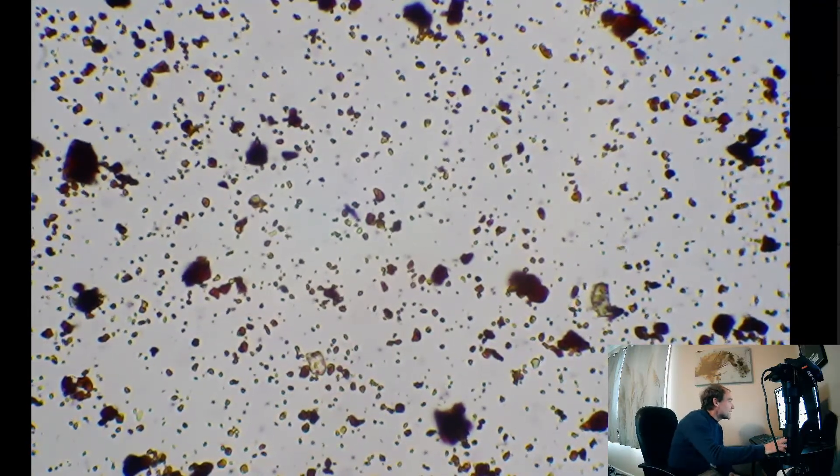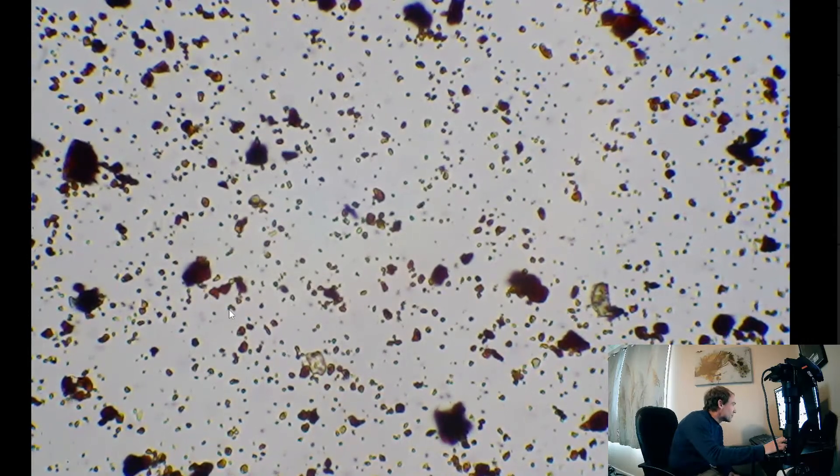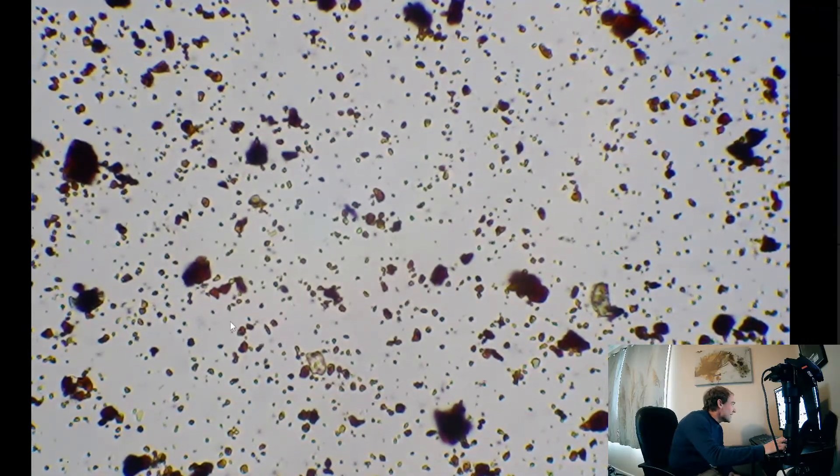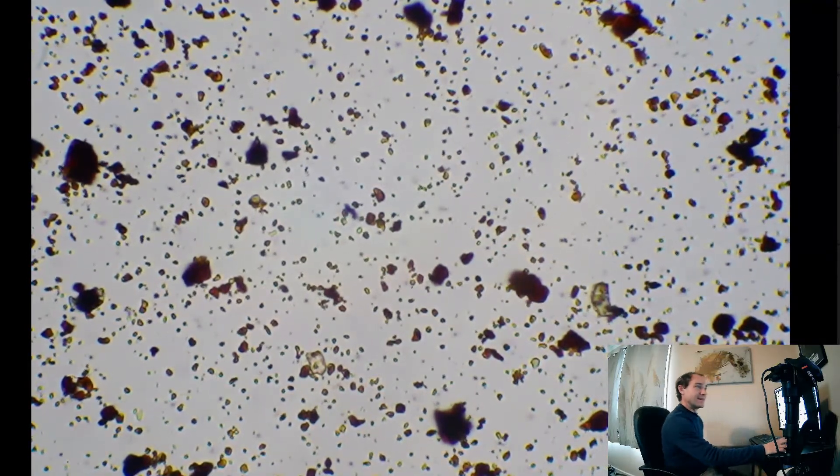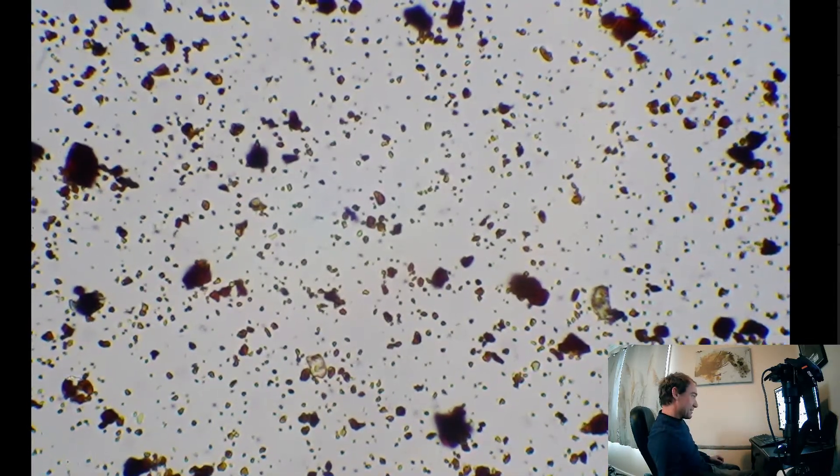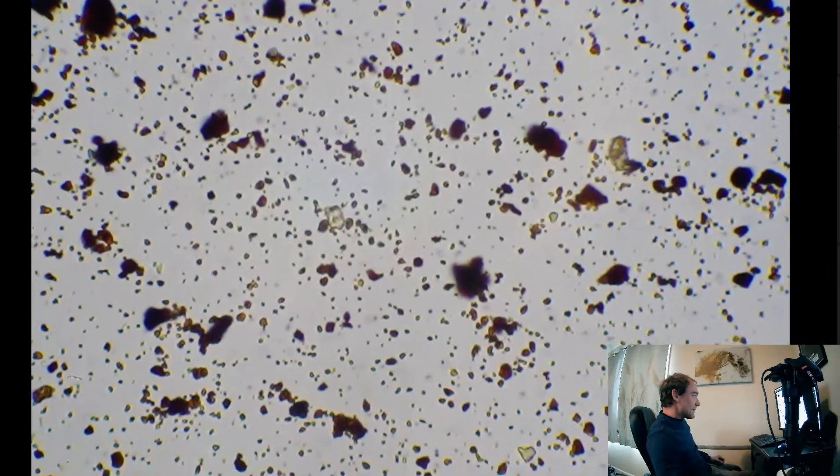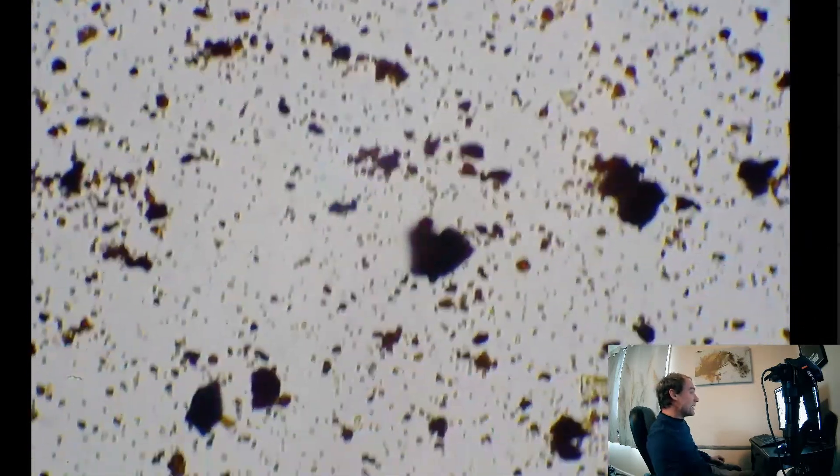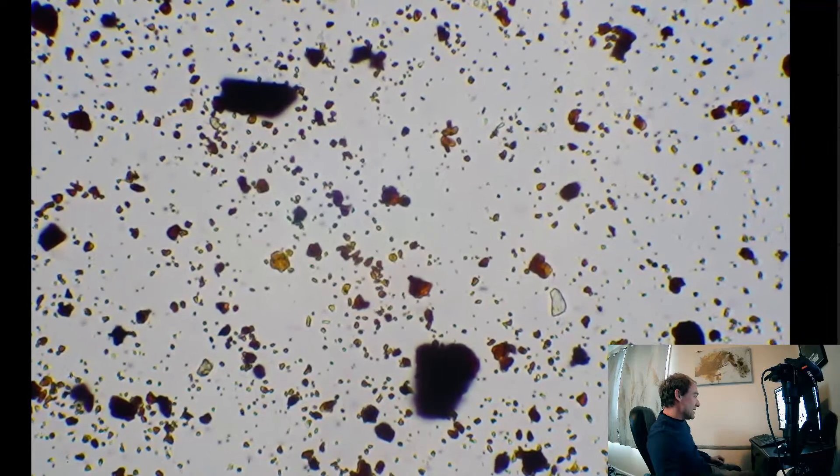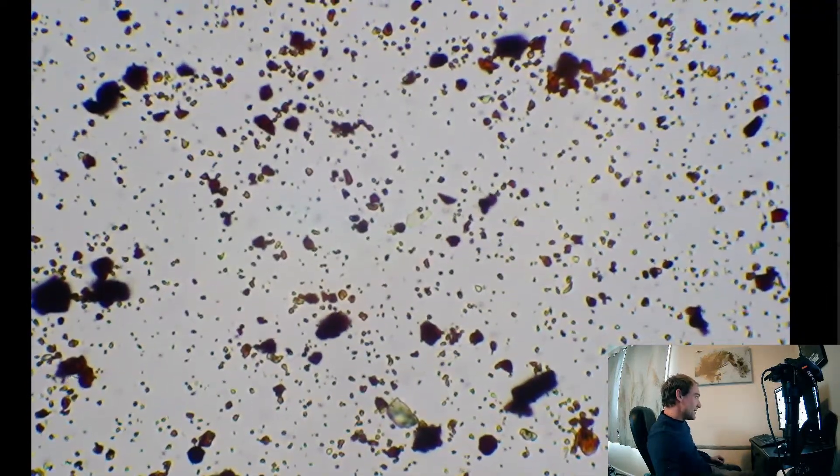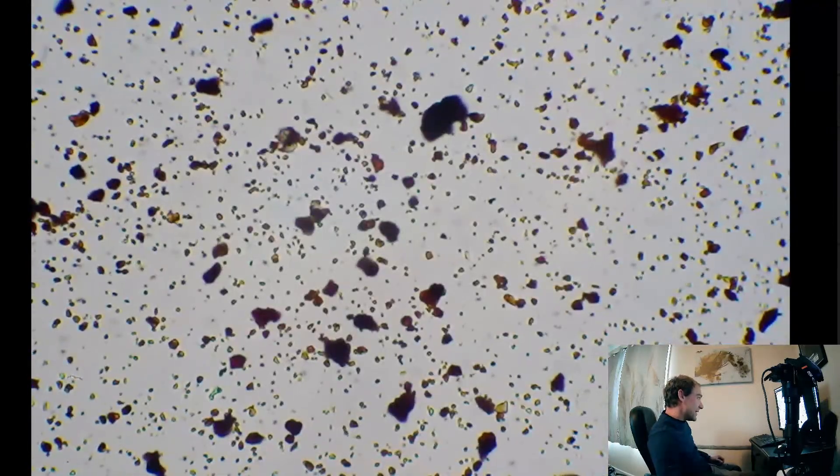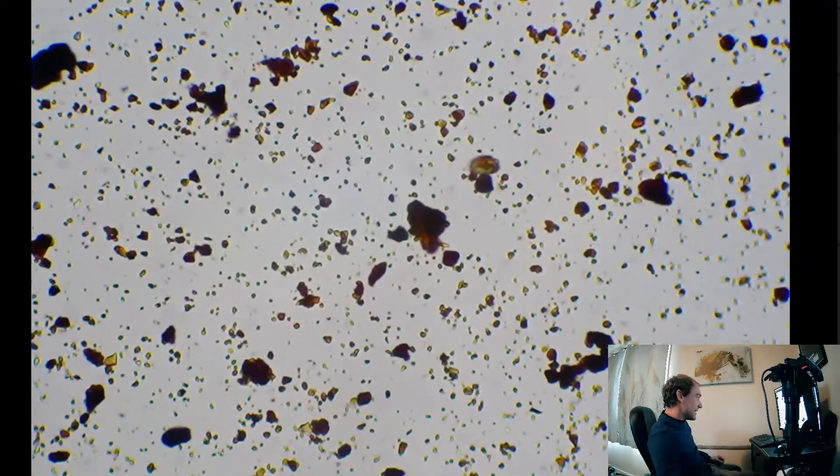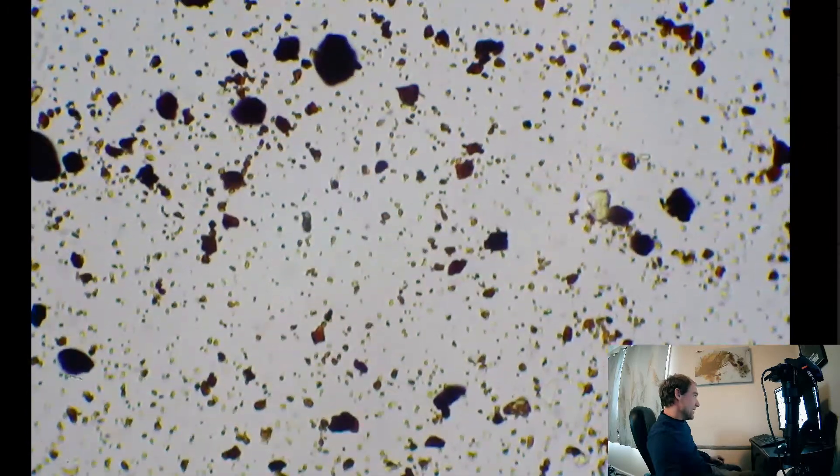Let's see what we see for shapes and sizes. A lot of round ones, we got kind of a pill-shaped one there. Yeah, a whole lot of life in this Rejuvenate. I wasn't exactly expecting to see this much because I thought it was mainly a food for the microbes, but evidently they love it so much that they are in there in abundance. That is a whole lot of bacteria.